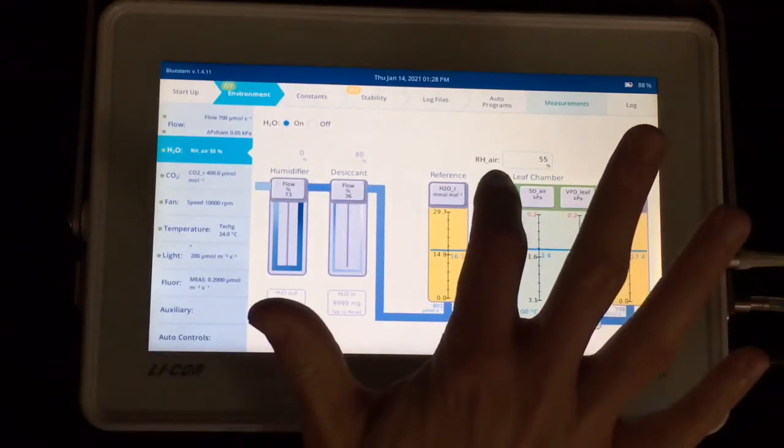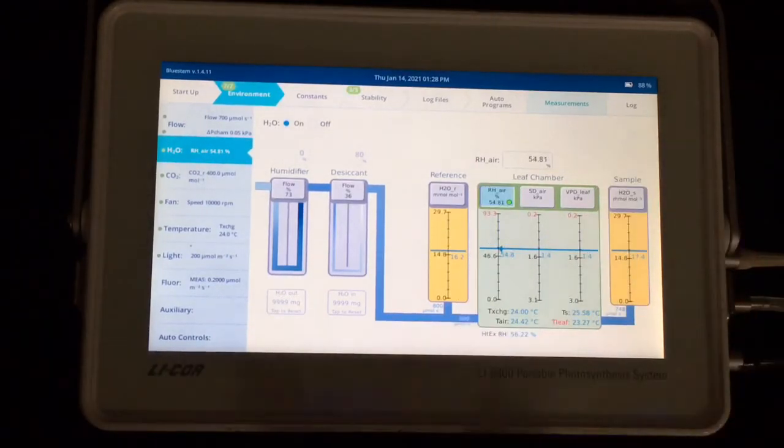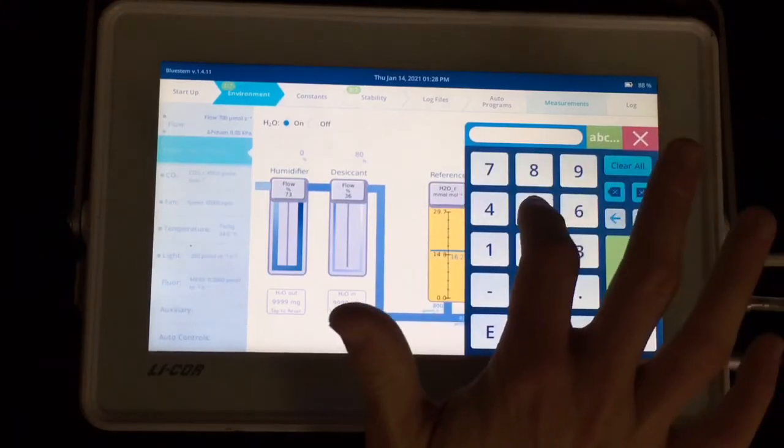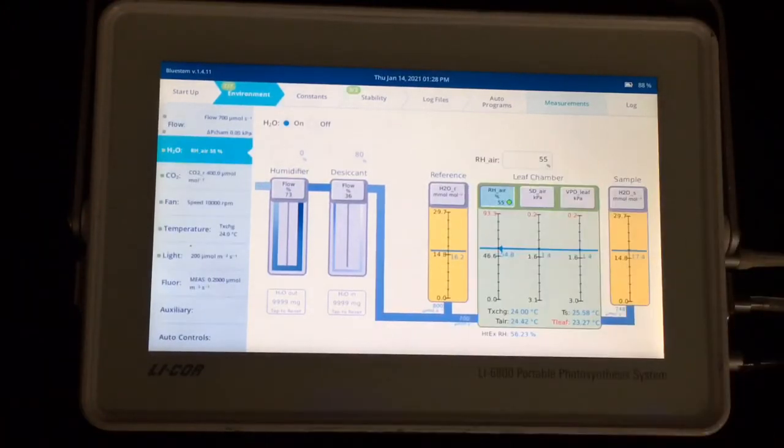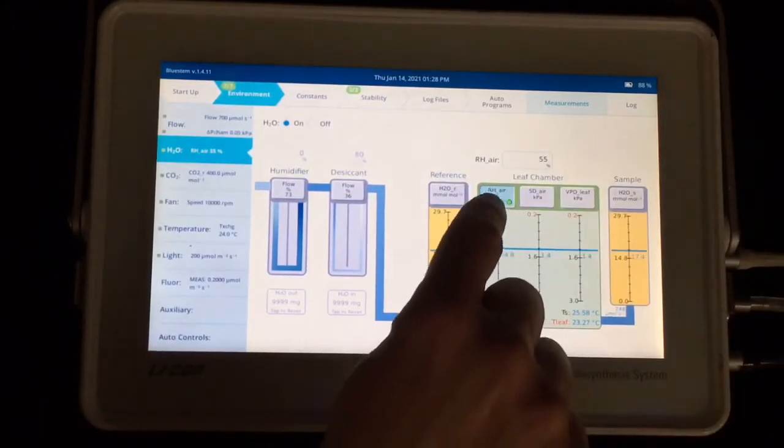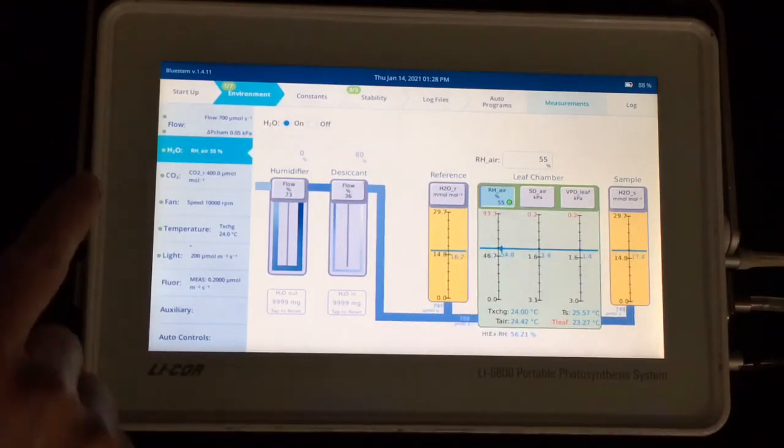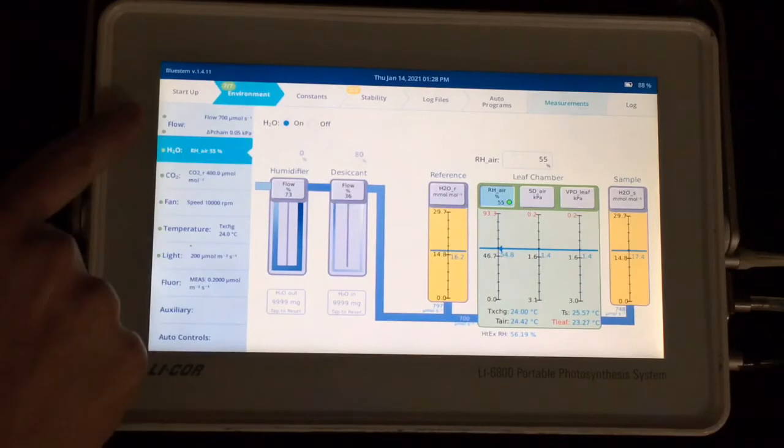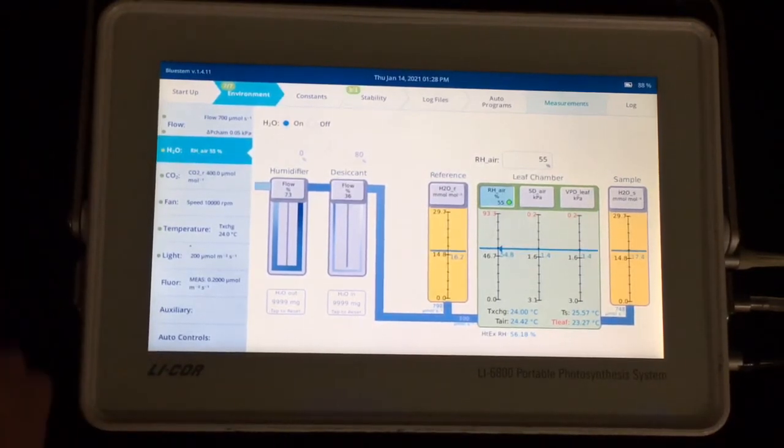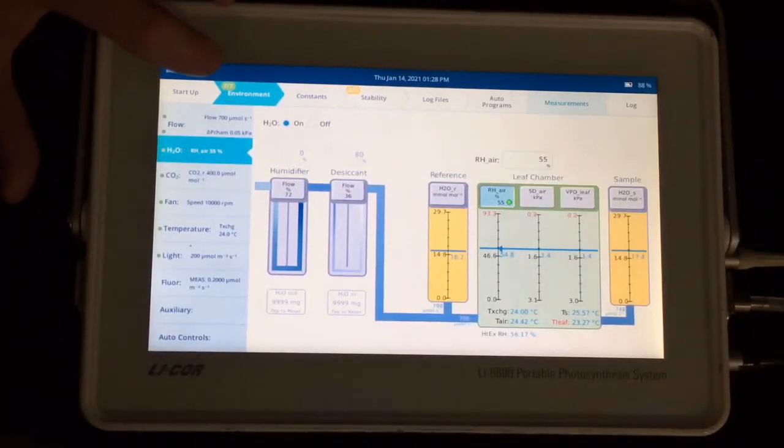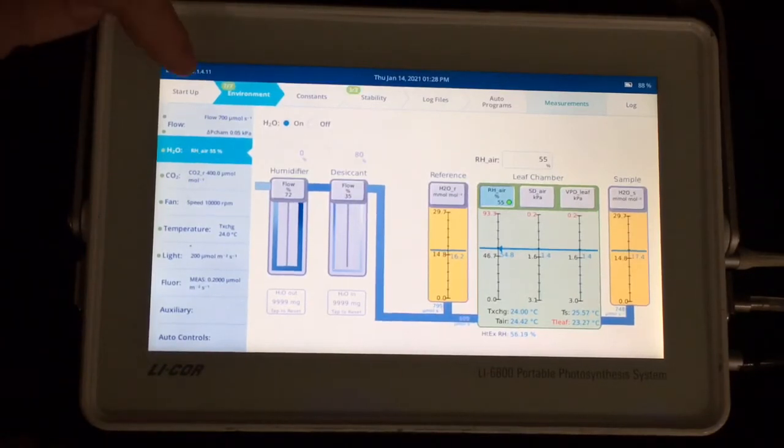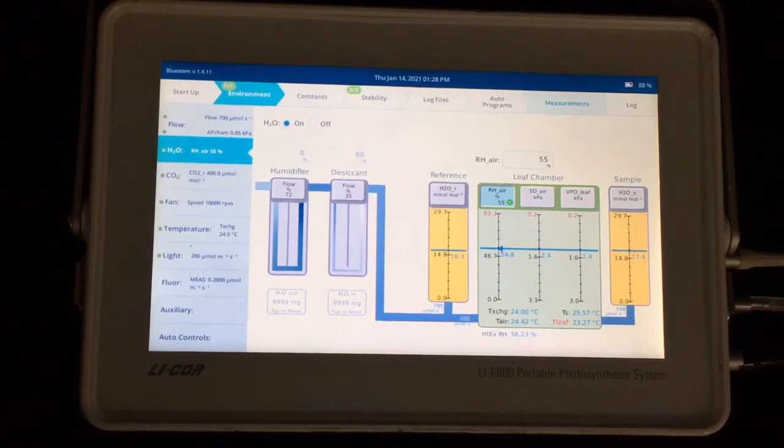And again, you set those by tapping on the variable you want to change and then picking a setpoint. And you'll also see when the setpoint I'm choosing hits its mark and is happy at the setpoint you've chosen, you'll see this green circle telling you that. And that's also visible down the left-hand column over here. And up top, so if you're on a different screen, you can see of the control loops you have working, how many of them have hit their setpoint. And in my case, all seven have hit their setpoint.